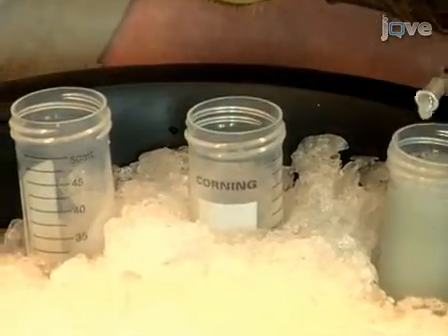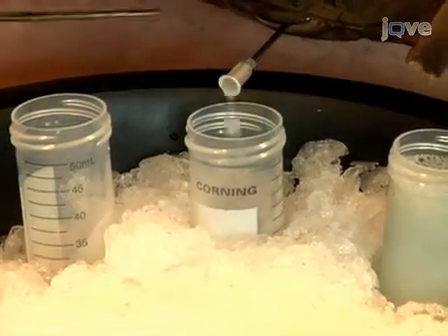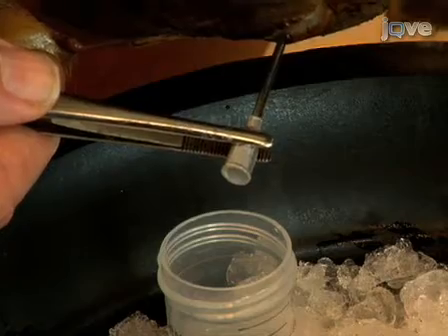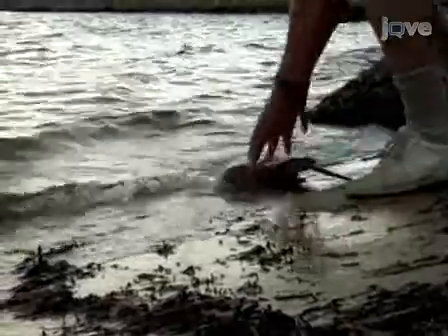As soon as the heart is punctured, blood will flow rapidly in a continuous stream. Keep the needle positioned carefully above the collection tube. As each collection tube fills with blood, rotate the ice bath to bring the next empty tube beneath the needle. When the animal stops giving blood, remove the bleeding needle from the heart, recap the tubes, and return the animal to the ocean or to its aquarium.